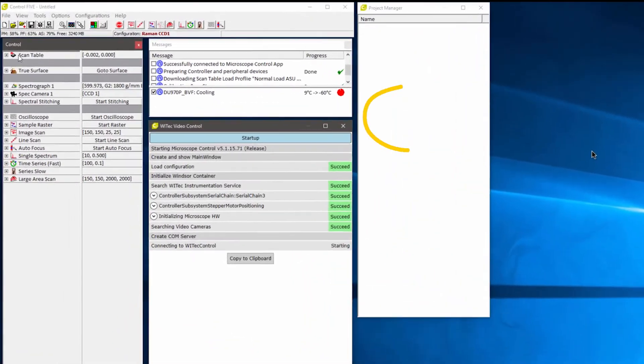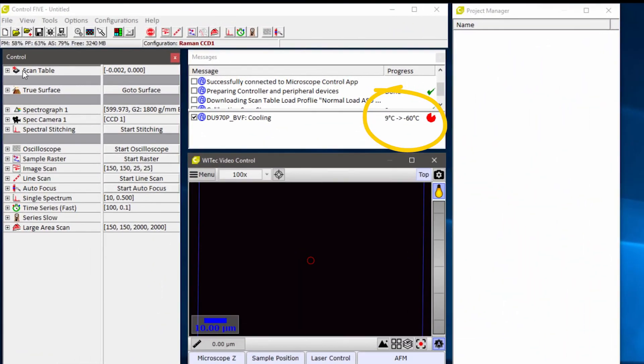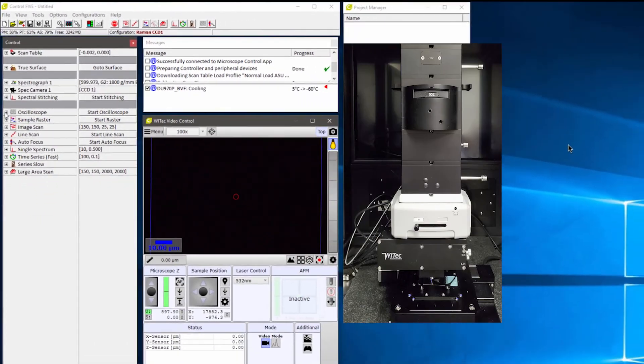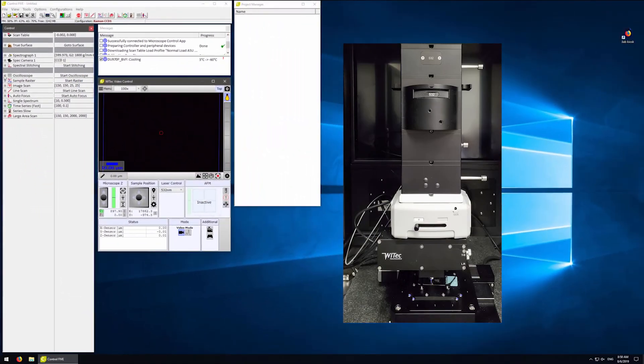The software has started. You will notice that the detector is still cooling down. It will take several minutes for the detector to cool down to minus 60 degrees Celsius. However, we can start setting up and using the instrument while the detector continues to cool down.